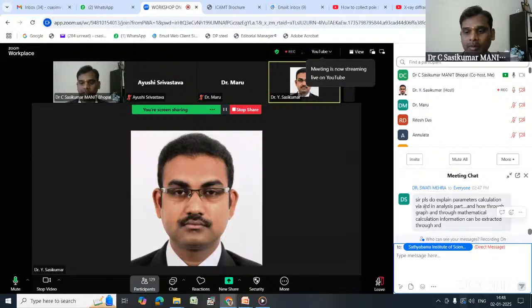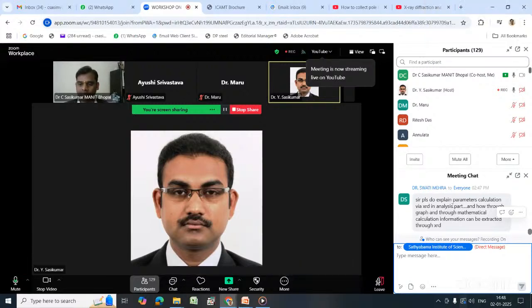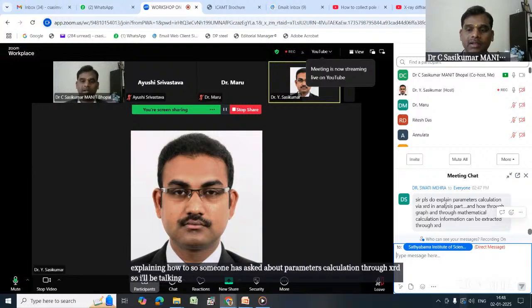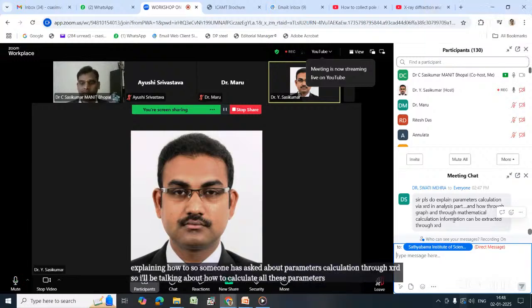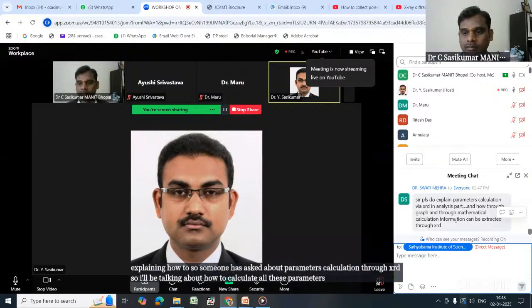Yeah, I'll be talking about the X-ray software. With the software, I'll be explaining how to do it. Someone has asked about parameters calculation through XRD, so I'll be talking about how to calculate all these parameters. Audience, any other questions?